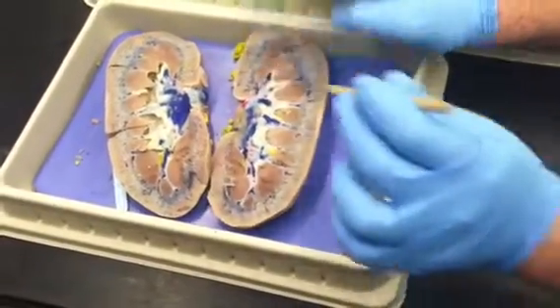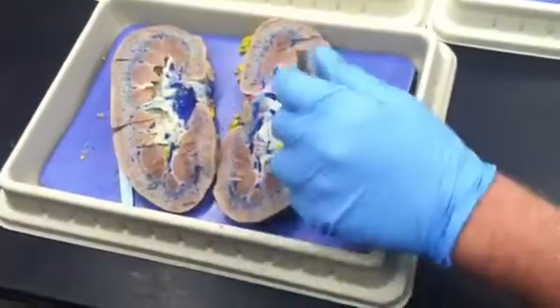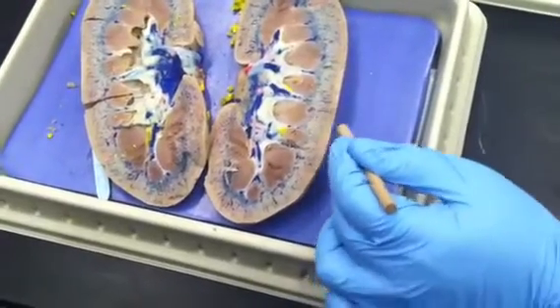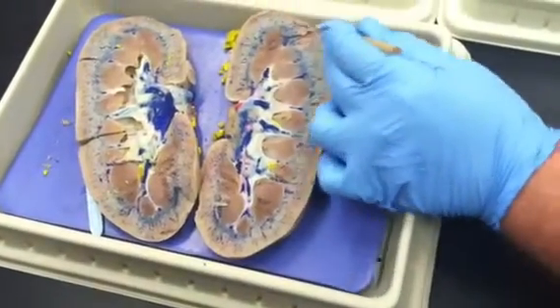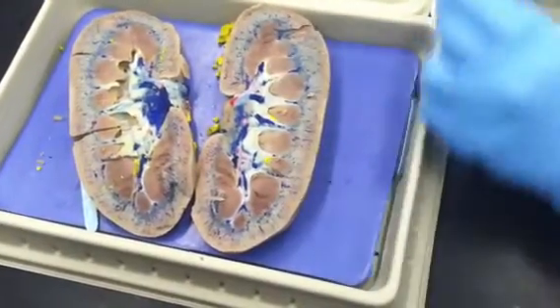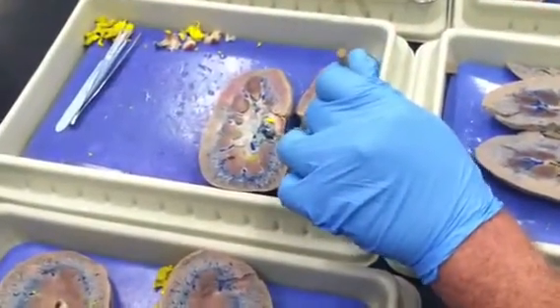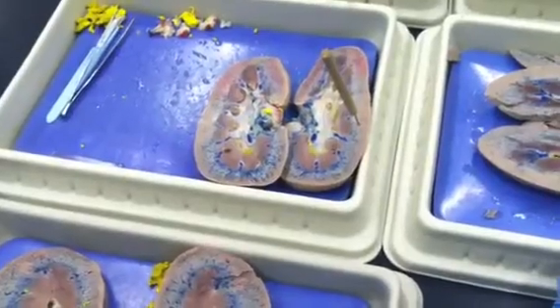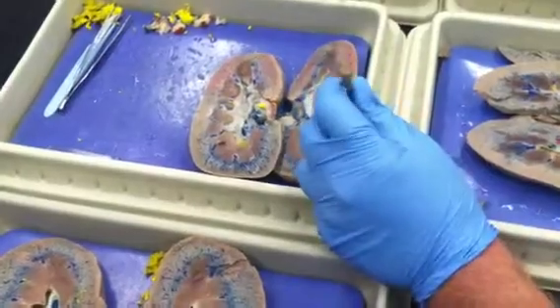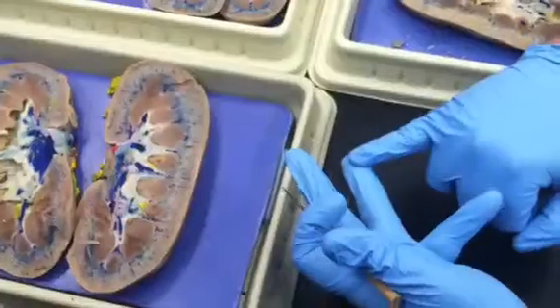Then if I were to take my probe and illustrate the cortex, I would just stick it in here. The renal cortex is any of this layer right here. That's all cortex, and it's distinguishable from the medulla by the lighter color. So you can see it clearly in any of these. Anywhere in here I stick my probe, if the question is, what layer is that? Renal cortex.